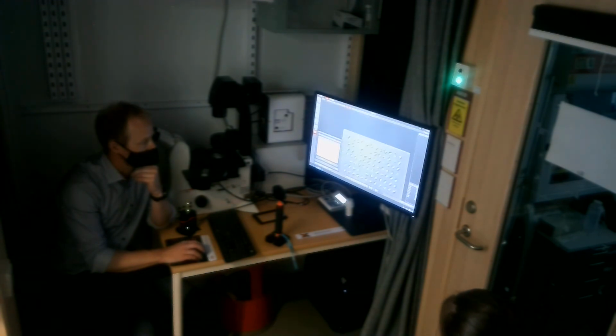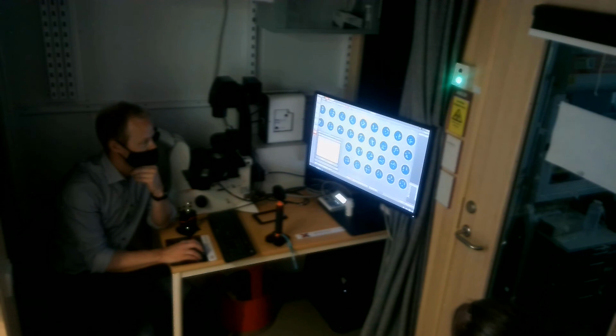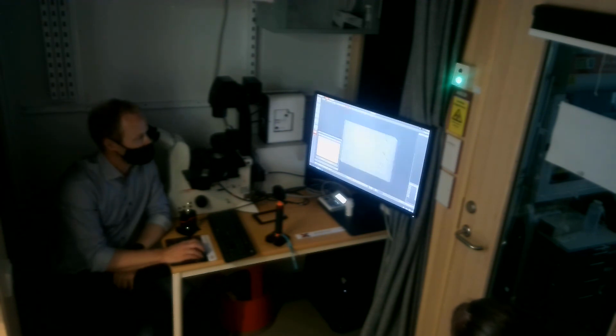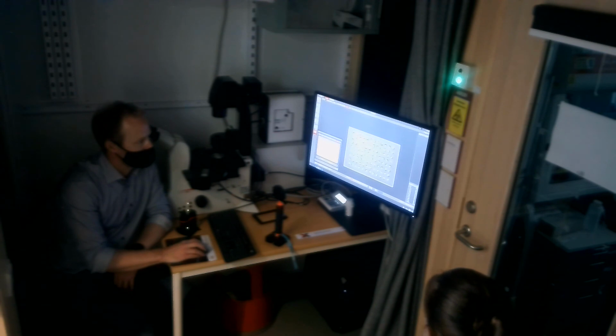So now it puts 5 randomly distributed fields of view in all of these. You can absolutely go in and select one and move that around if you want. There is a reason for it. And you can also see here that the task list is now helping you to identify. So row A, well 1, is these ones.